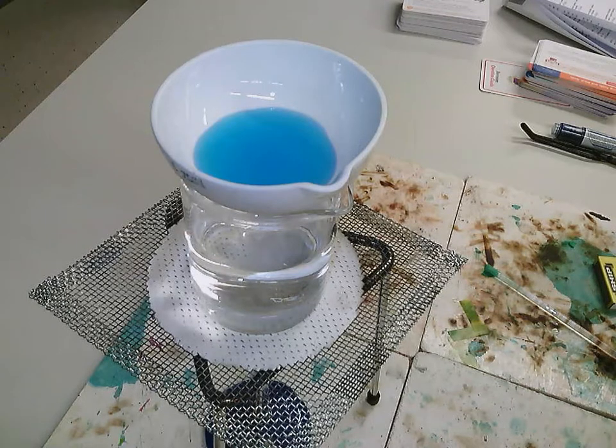And the way we'll know all the water is gone is we'll weigh it. So what we'll do is when it looks dry, we'll put it on a scale, so we'll weigh it. Then I'll put it back onto the water bath and leave it for a minute, and I'll take it off and I'll weigh it again. And I'll keep doing this until the scales no longer decrease, and that gets rid of all the water of crystallization. I'm going to pause this now until it evaporates a bit more and heats up.